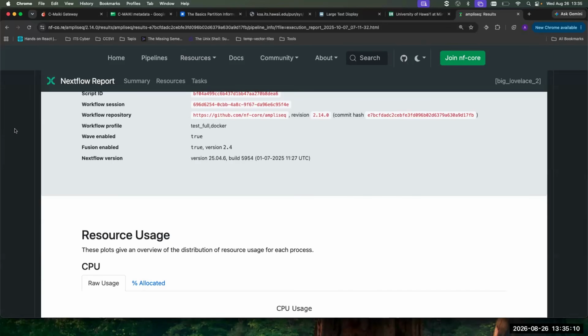One way to do it, or you can just publish your code, but you still have to have a methods section. And Ampliseq will generate a methods section for you so that you can basically say, here's what I did, but Cedric's pipeline won't. So that's why you've got to either specify it all yourself, which means understanding it, or just cite a paper that has done something default.